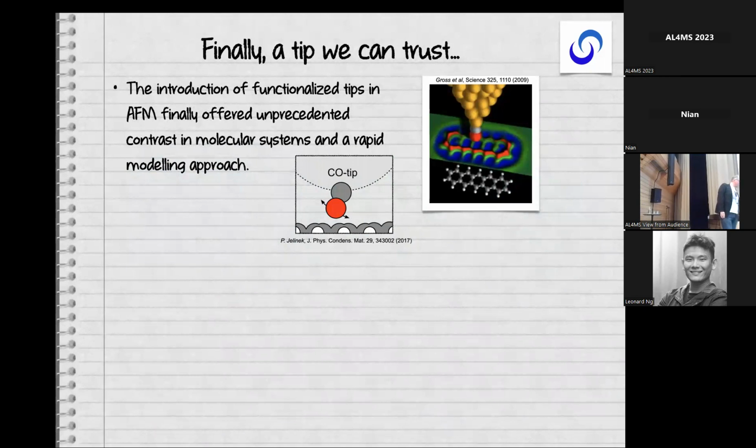I think yesterday, Maria, in talking about STM, briefly touched on the role of, I'm going to say, hyperparameters in SPM imaging. I think this is a very nice way to condense almost my whole career into one word of understanding these parameters. And the most important parameter right from my PhD was the tip. So if you're imaging things in atomic resolution, it's actually the nature of this last atom, let's simplify it, last atom on the tip that really matters. And we spent a long time as theorists trying to understand the role it plays.